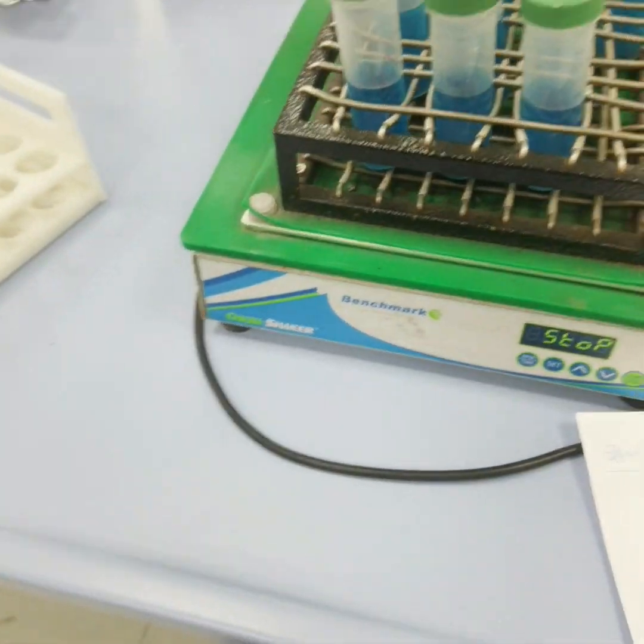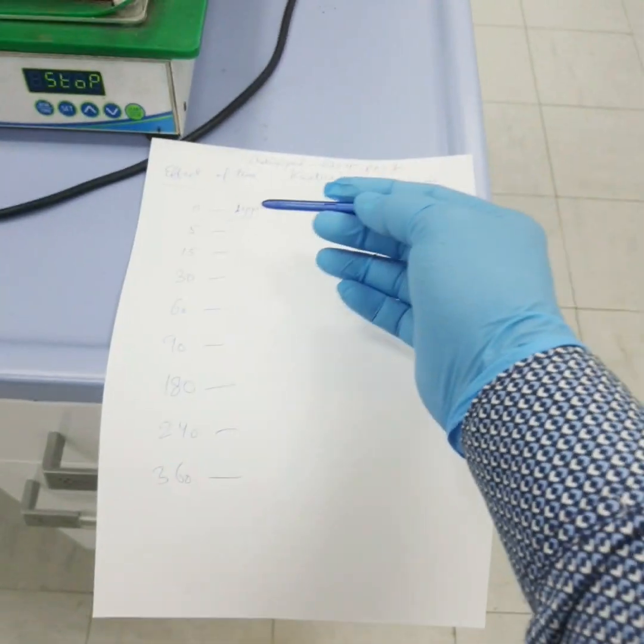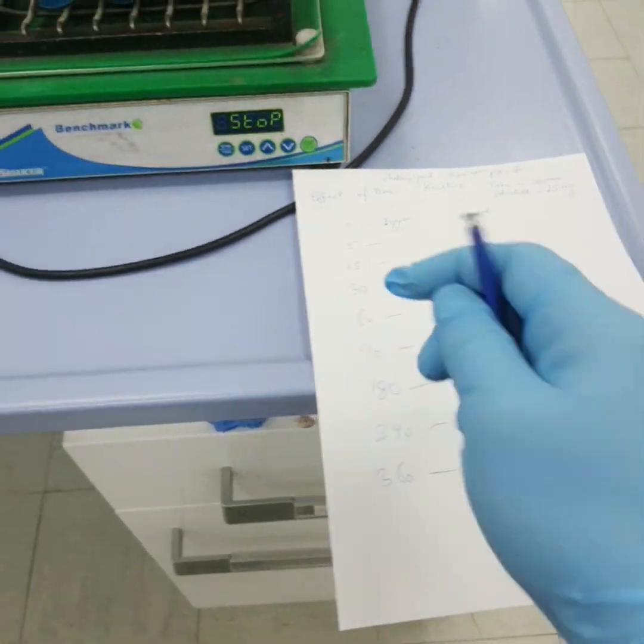We have transferred all the vials into the orbital shaker. Now this is our respective time, 0, 5, 15, so we'll go up to 6 hours.